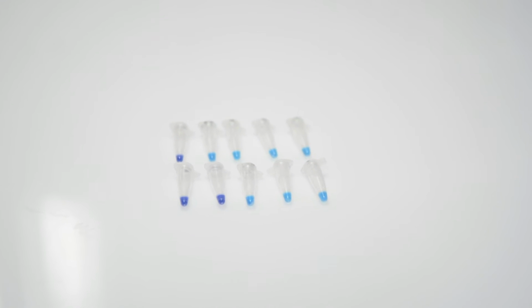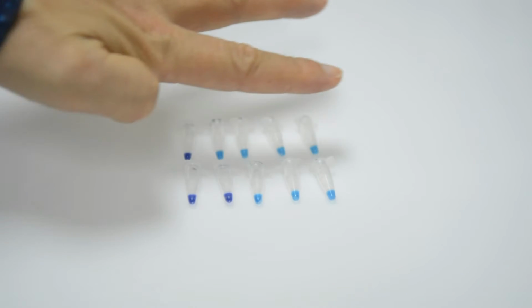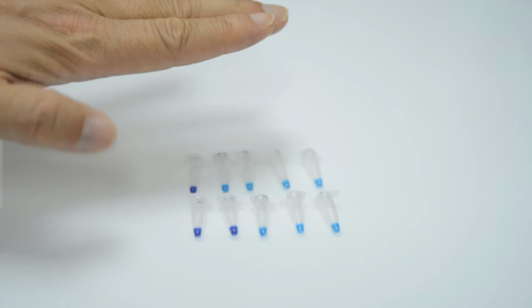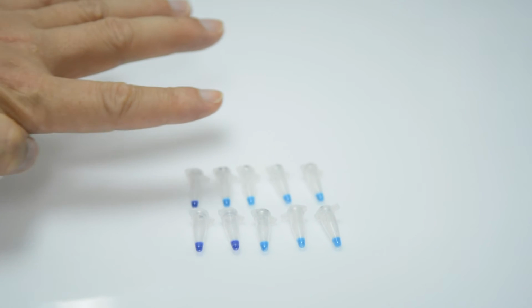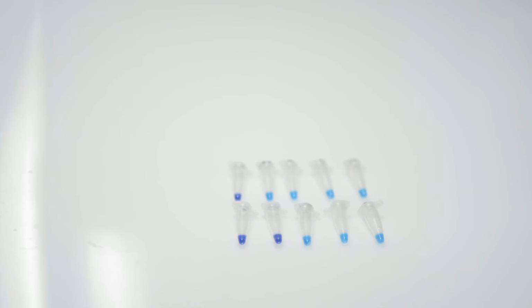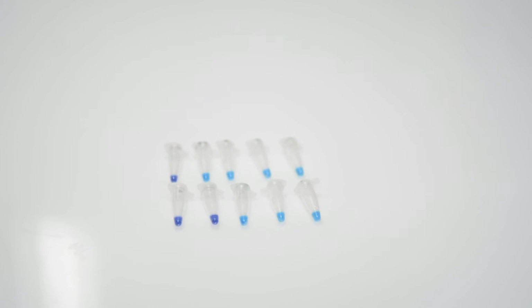So now you can see the result. In the top line, we are detecting the internal control target gene from cassava, so this should be positive in all diseased or healthy cassava. In the lower part, we are detecting the cassava witches' broom disease phytoplasma.